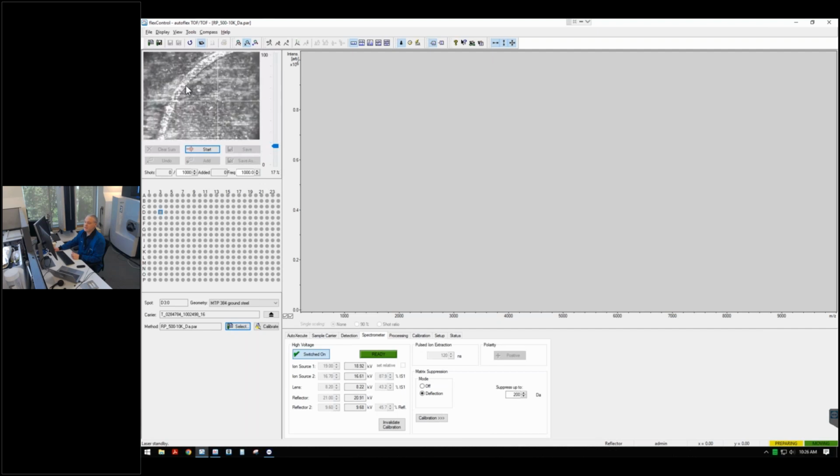Okay, so here we see the co-crystallized matrix, analyte, and salt. A nice thin layer of crystals, very small crystals, which is what we like. And so what we're going to do now is start the acquisition. Now it's applying the voltage to the laser, warming up. And then once that happens, we'll see in real time a spectrum, I hope.